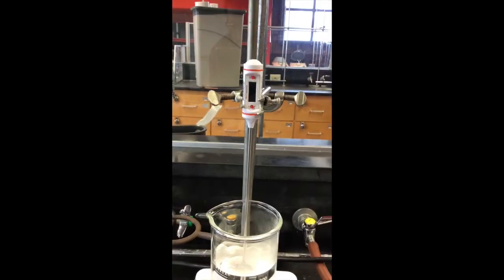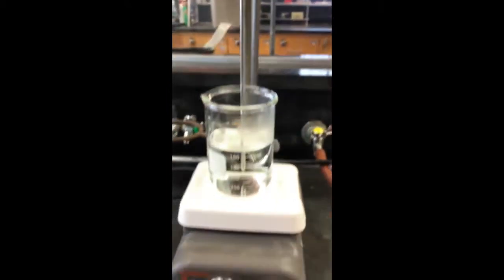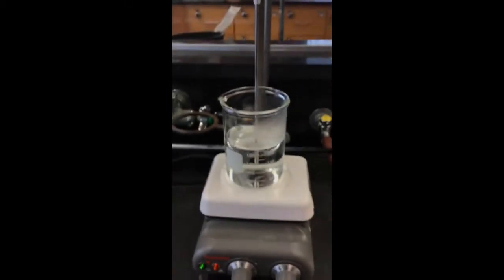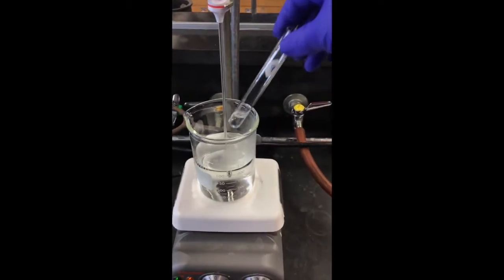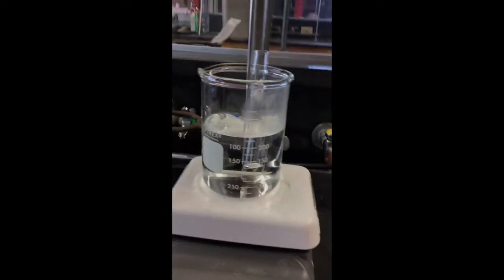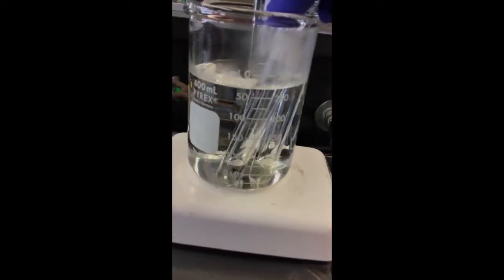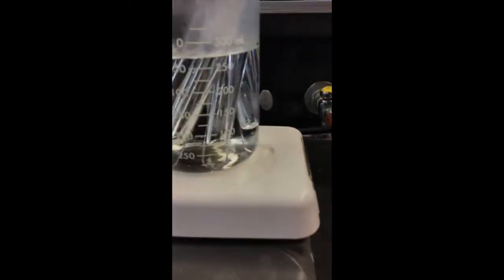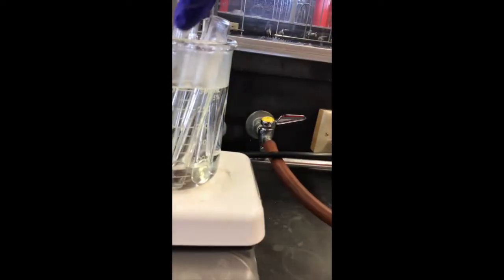All right, so, oh, you can't see that very well. That says 48. That's good enough. We got a hot water bath going on right here. I put it in a beaker specifically so that I could just go, what's up, number 9? Set you in there. And then I would just kind of start the clock. So let's go ahead and get everybody in there. I said complicated, but I guess what I really meant was crowded. It's going to get crowded in there, and we're going to have to keep an eye on the ones that form that precipitate.